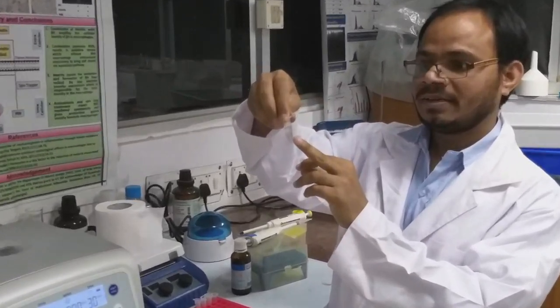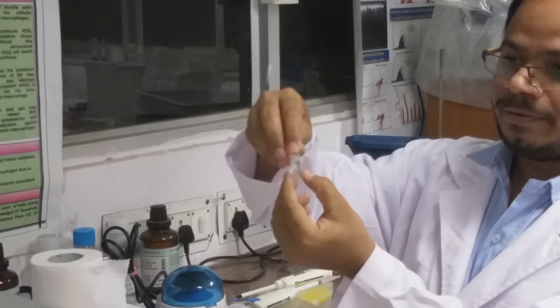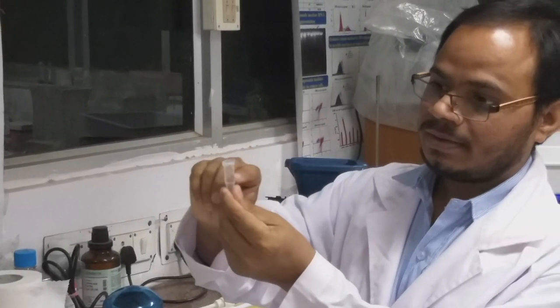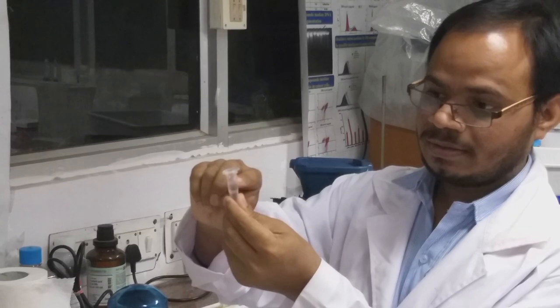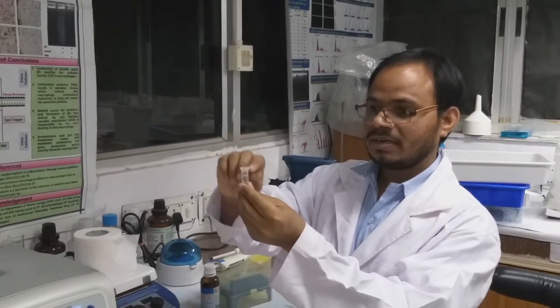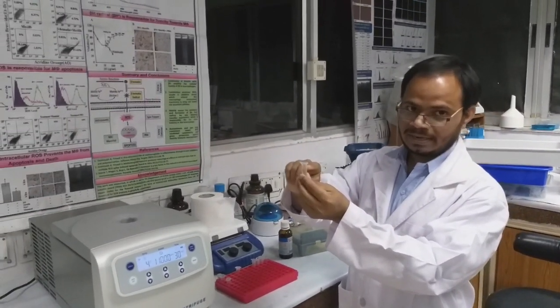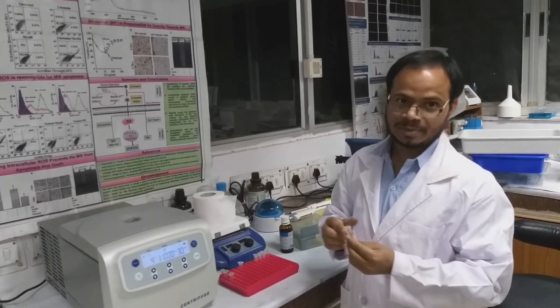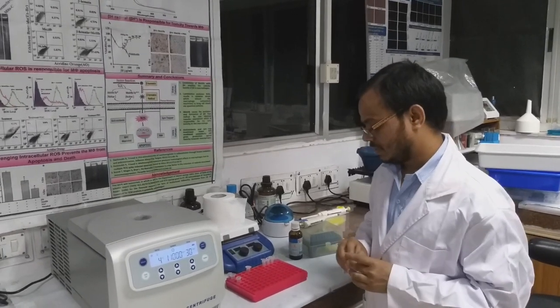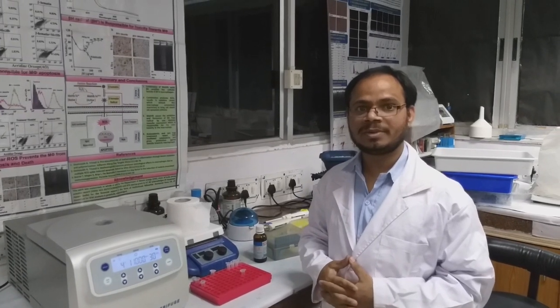As we can see, the phenol chloroform mixture is a high density component, so it will settle at the bottom portion, and the water containing plasmid DNA separates on top. We will just take out this top portion which contains plasmid DNA, then we will precipitate with the isopropanol and use it for applications. This is the overall procedure for isolating plasmid DNA from bacterial cells.